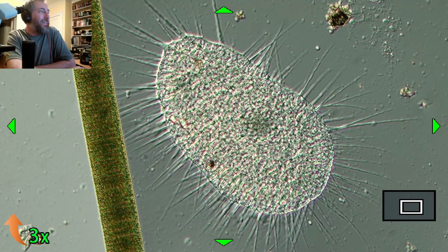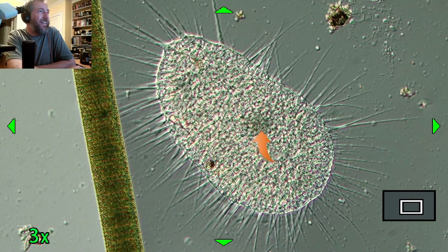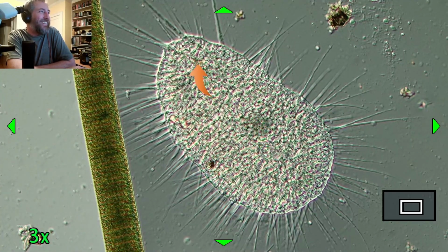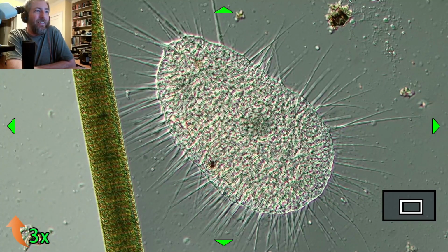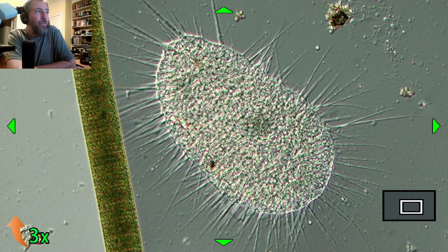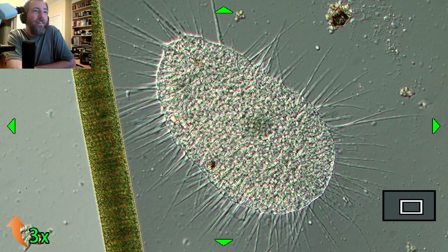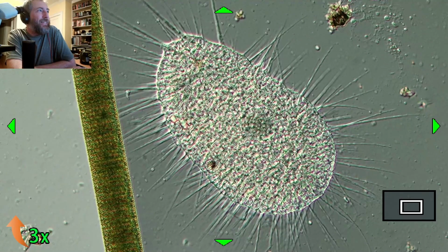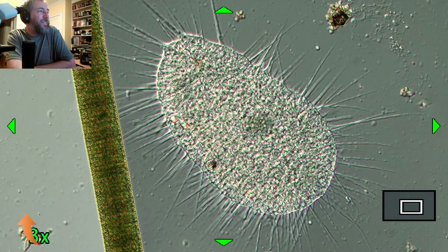So that creepy thing also ate something. Some bits of lunch that it had right there. I don't know what it ate, but it rolled over something. Ooh, a vampirellid. That would be amazing. An amoeba with hairy legs. Lunchtime is exposed. Yeah, exactly.